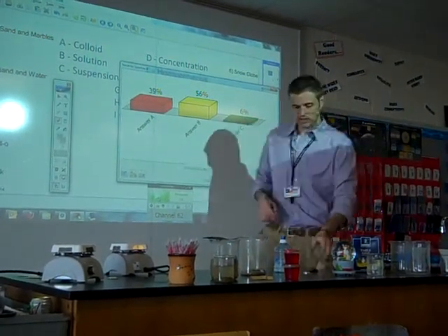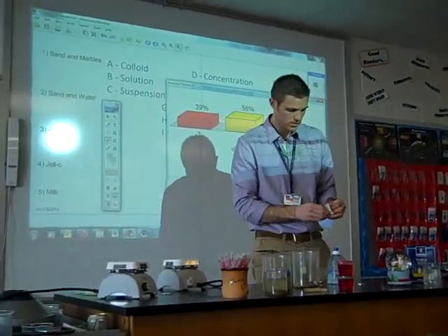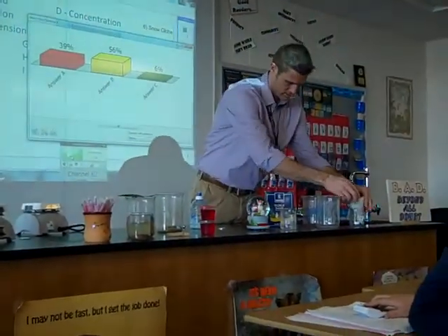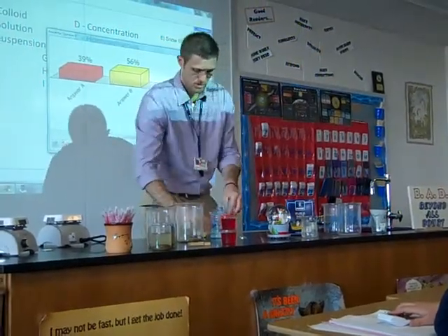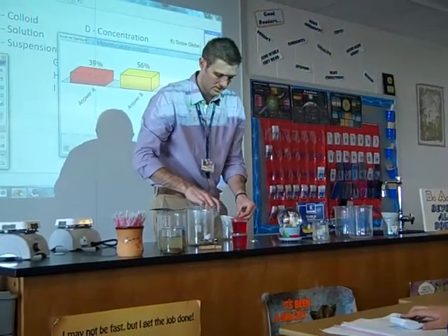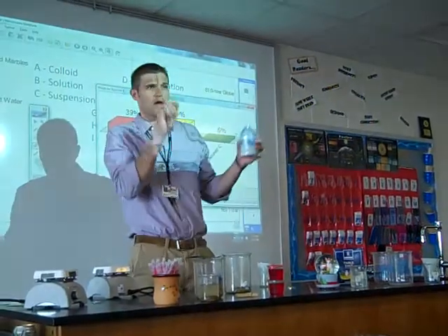Does it scatter light? Okay, so let's do that. We can do that one pretty quickly. Here we go. I'll put this in here. I'll use a different one to make sure that it stays clean. Okay, open this up. Pour some milk in here. Give it a little bit of time, maybe some more. Okay, alright, there we go.